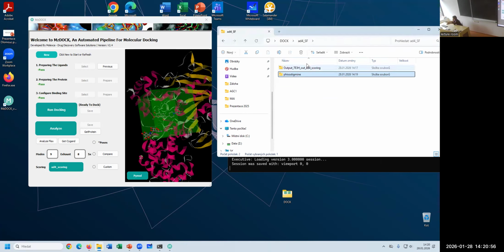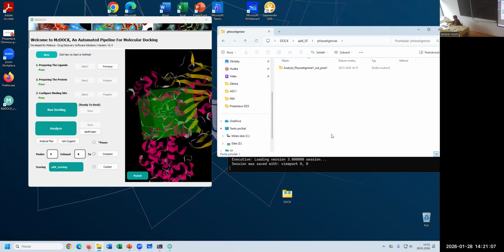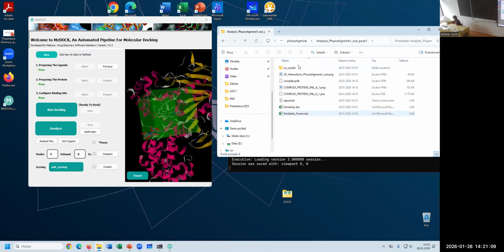Also, we can decide to open in PyMOL, to overlap in PyMOL both the donepezil binding mode and the physostigmine binding mode. Should I just score? Report.